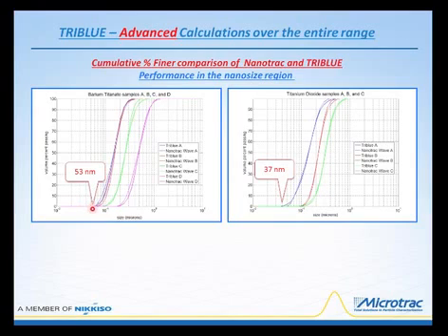But this is an irregularly shaped particle, and you can see that there are some slight differences between the two materials, sample A and sample B, which the customer was expecting.